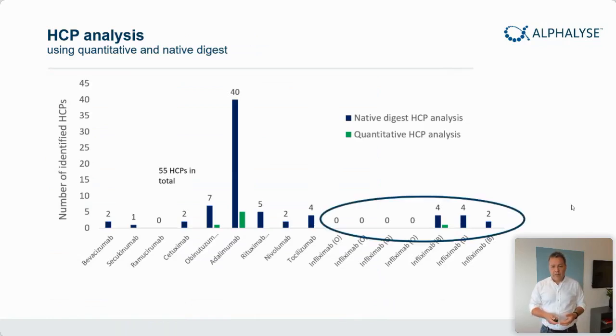And here we have the biosimilar, and here we have actually Humira. I think one of the reasons why it's so much more dirty than the others is that Humira originally was not purified with protein A. So that's the reason why we have this high level of HCPs.